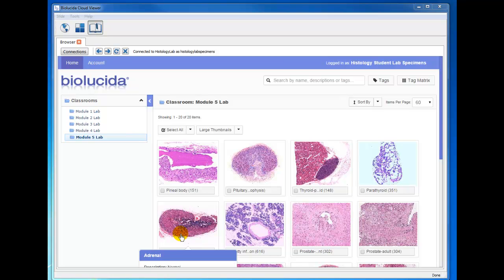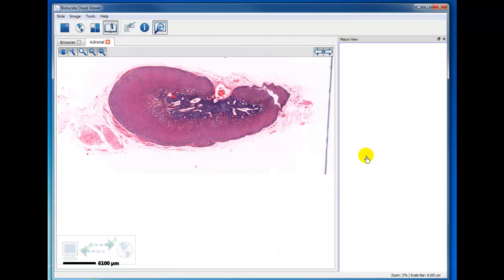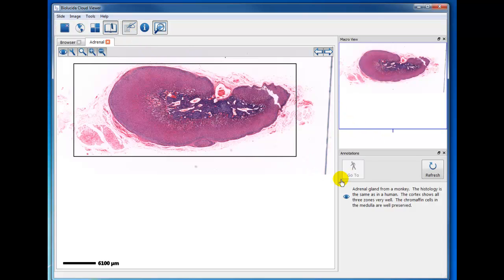This is a video tour of the adrenal gland specimen you're assigned to study. The adrenal gland, as I think you will remember from lecture, is composed of a cortex and medulla. It's part of the solid organs with a cortex and medulla and surrounded by a capsule, located in the abdominal cavity.